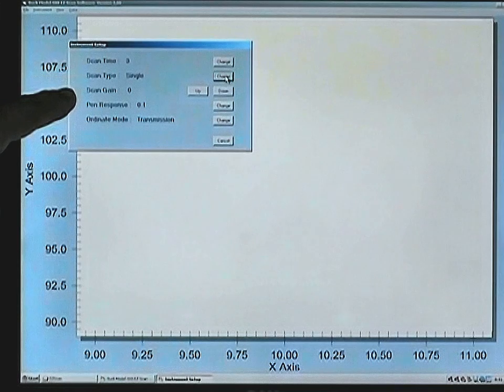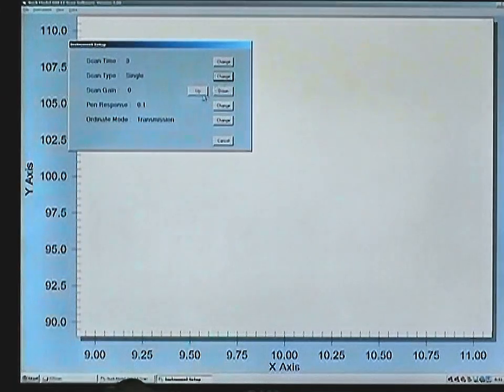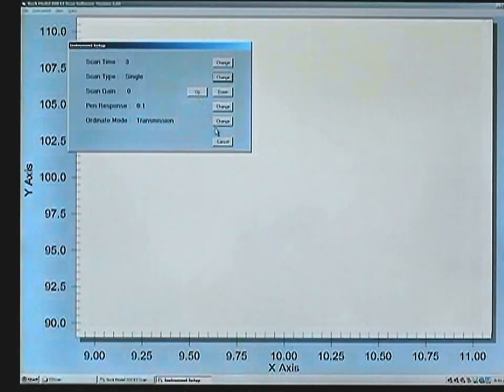A gain of 0 is useful most of the time unless you have an accessory with a tremendous amount of light lost, then you can increase to a gain of 1 by clicking on the up icon. Cancel to exit this screen.